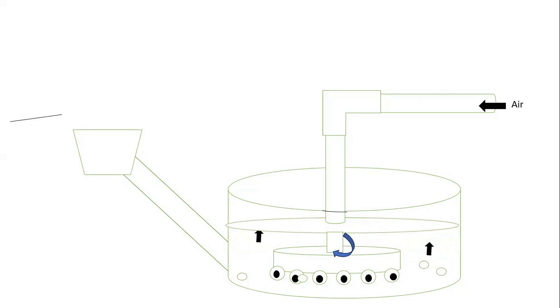See here, we pass it through this pipe. Here it comes down through this one, and here it goes outside, okay. So here we pass air through the liquid. Once the air enters the liquid, air bubbles are formed. I show here that there are air bubbles, okay. Here the air bubbles are there, here also. Now see how these air bubbles move. These air bubbles move here.